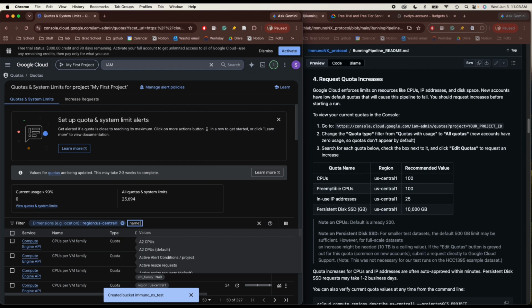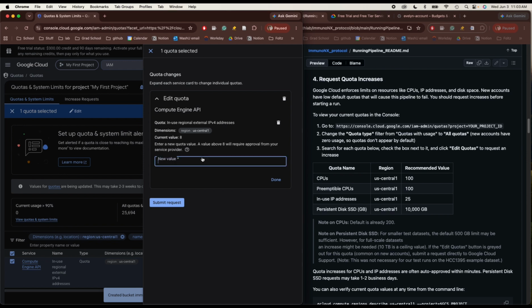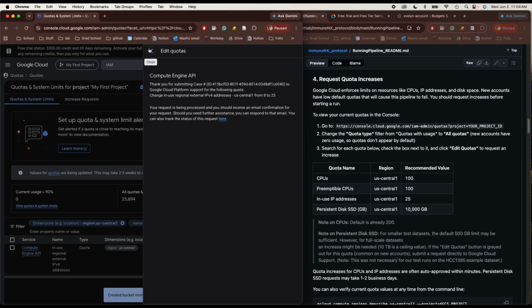Let's do the next one in use. IP addresses. Right now we have 8 and we would like it to be 25. Okay.